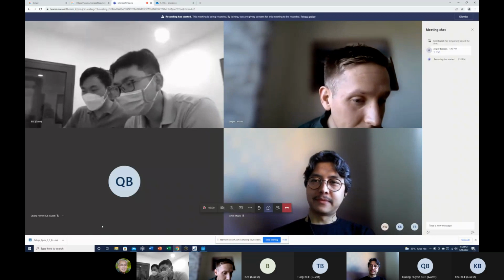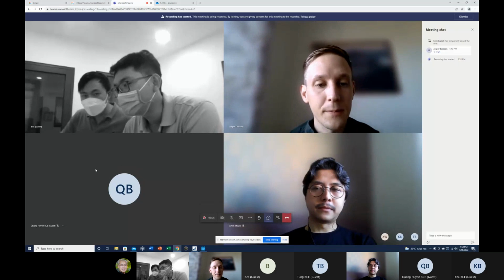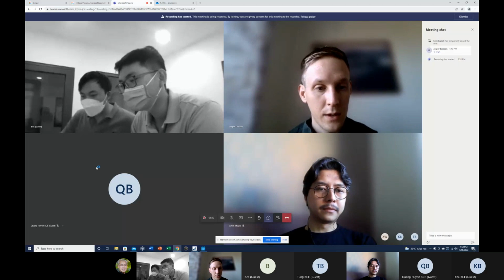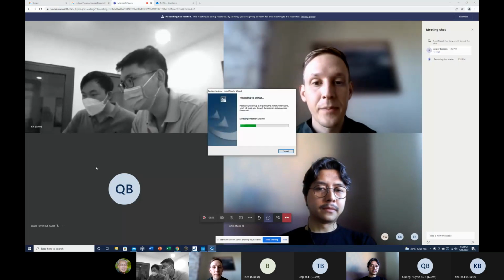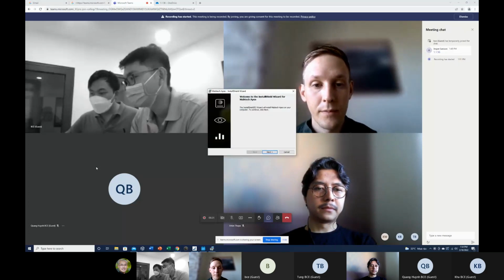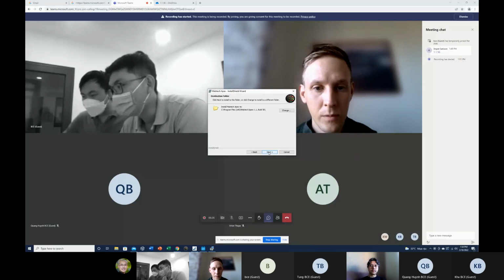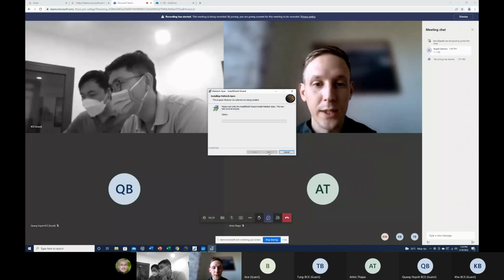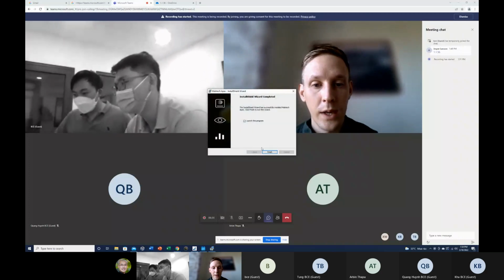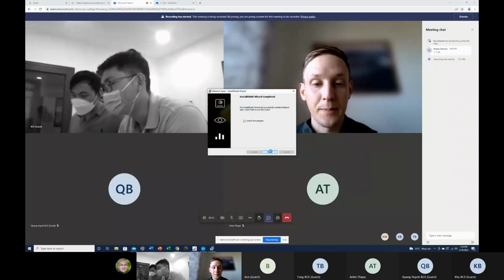Great. So now it actually looks like the download is completed. So you can click on that one. Okay. Open it. Yes. And then finish. Yeah, we just click next. Yeah, that's good. Install. Okay. And finish. And we launch the program too. Yeah, you can do that. Okay.